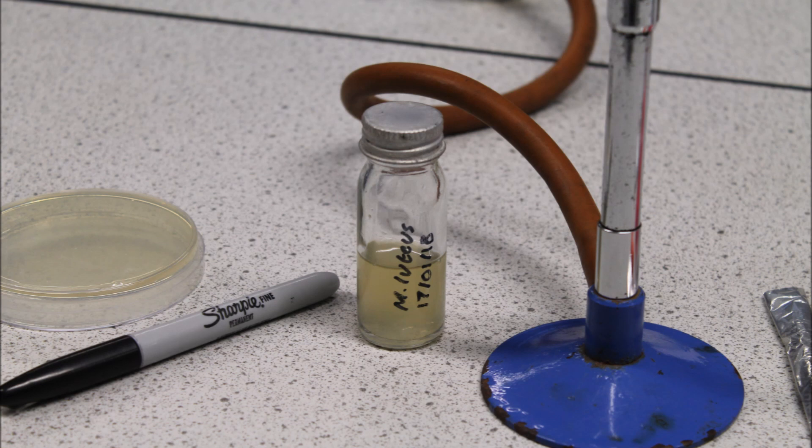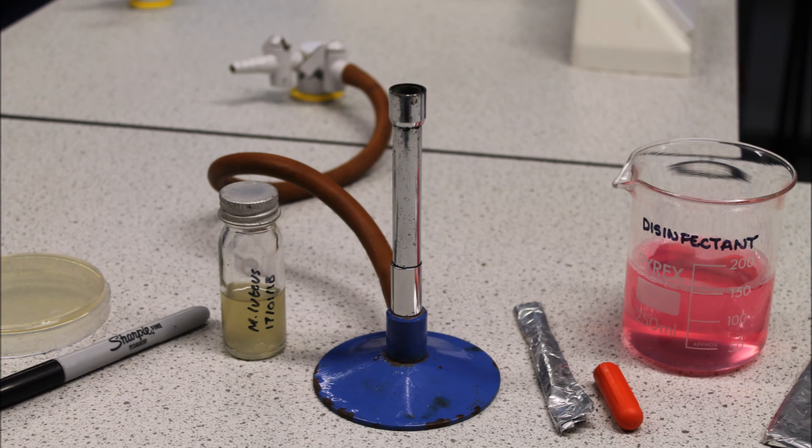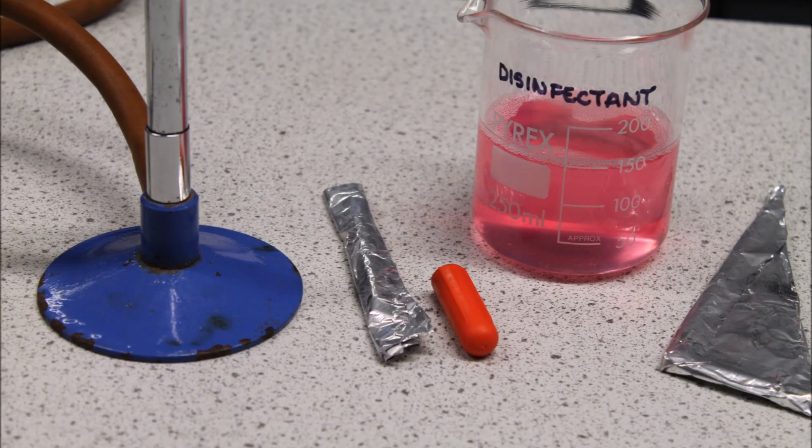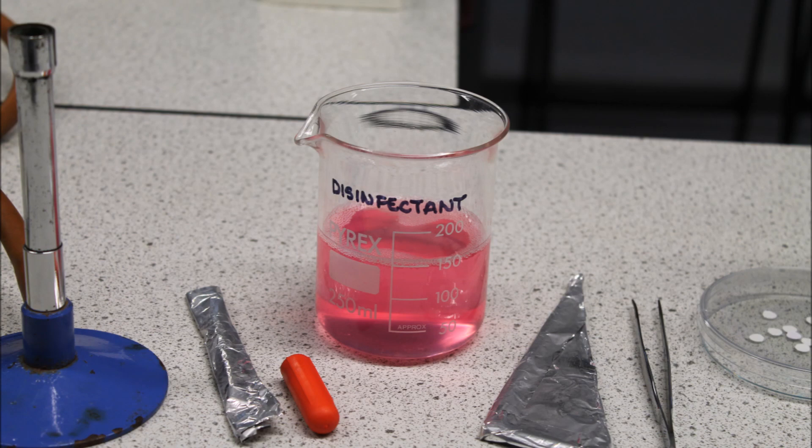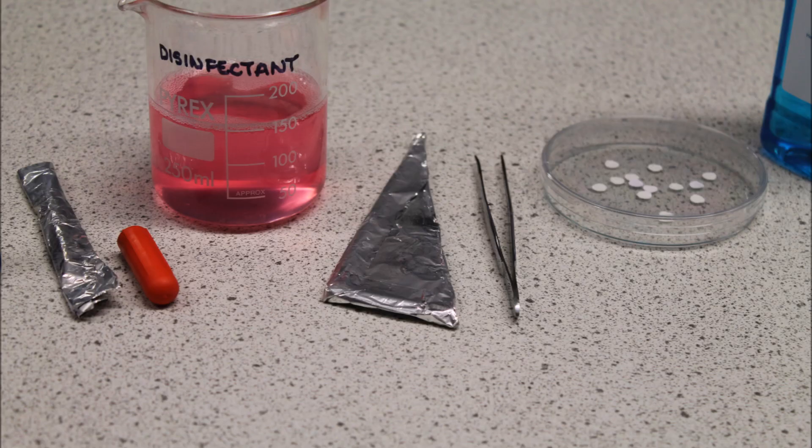A Bunsen burner, a sterile glass pipette and pipette teat. The pipette is wrapped in foil to keep it sterile, having previously been treated at high temperature. A beaker of disinfectant, a sterile glass spreader. Again it is wrapped in foil to keep it sterile, having previously been treated at high temperature.